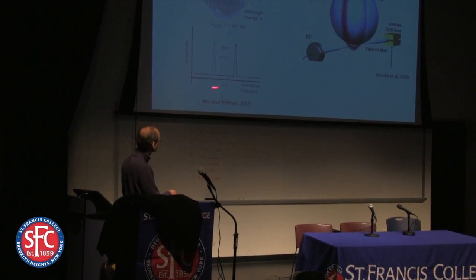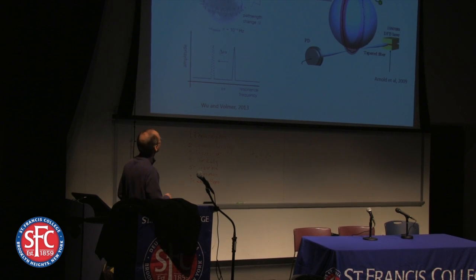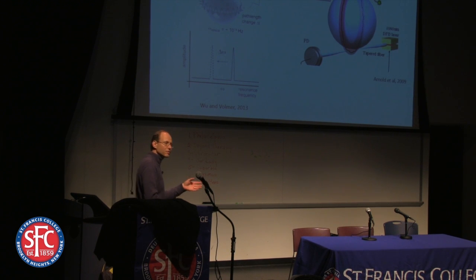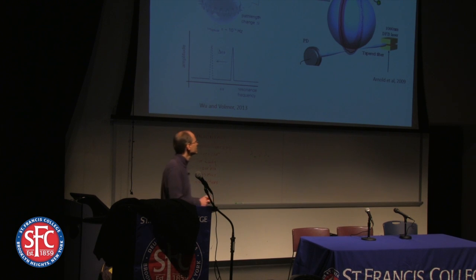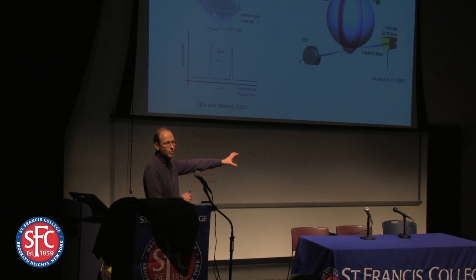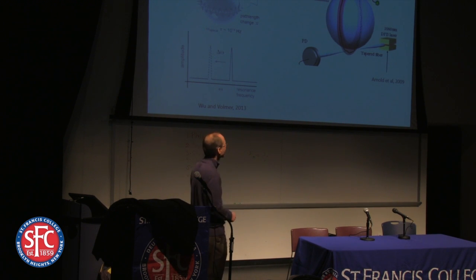This could be a wavelength shift here, or a frequency shift here, but equivalently you can look at changes in frequency or the wavelength of the light that gets trapped inside. And this can be done very, very sensitively, because you can resolve wavelength differences to within tens of femtometers. So very, very tiny differences, tiny enough to be able to see single molecules. So Steve's group has seen single albumin proteins with this, and other groups have pushed it down to just 5 kilodalton limits.